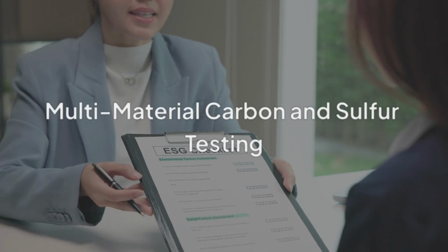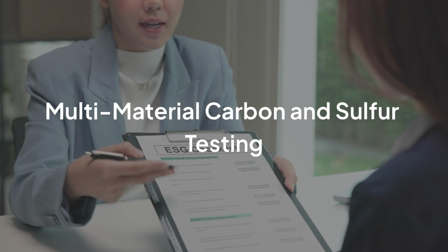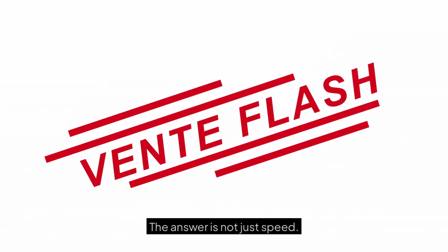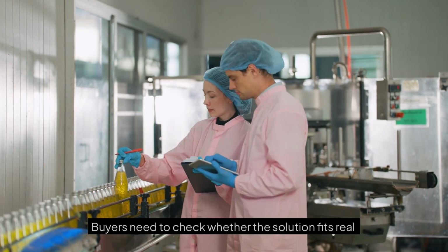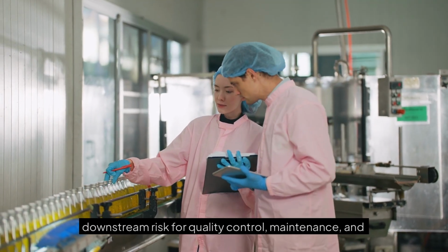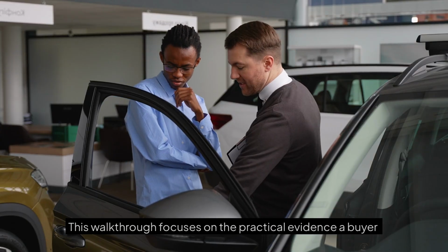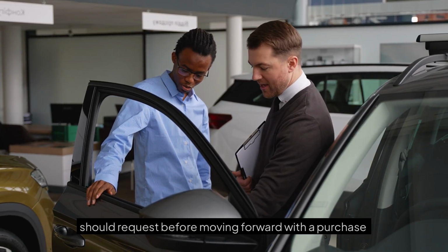What should procurement teams verify before choosing multi-material carbon and sulfur testing supplier selection criteria for industrial laboratories? The answer is not just speed. Buyers need to check whether the solution fits real production targets, delivers stable data, and reduces downstream risk for quality control, maintenance, and supplier coordination. This walkthrough focuses on the practical evidence a buyer should request before moving forward with a purchase decision.